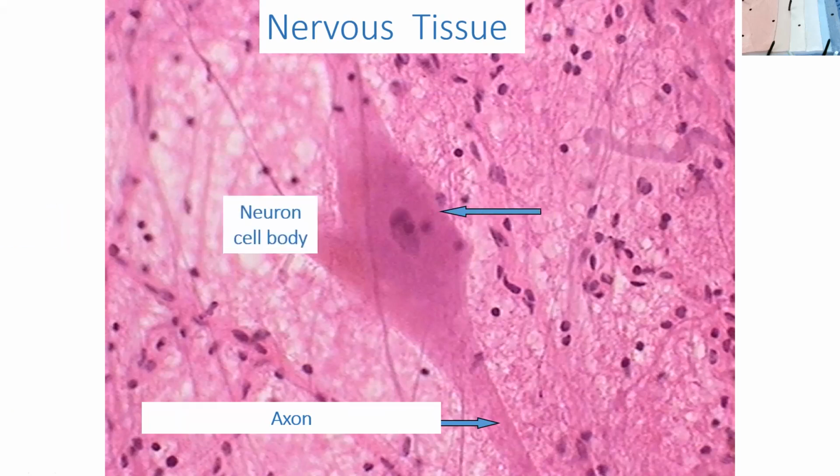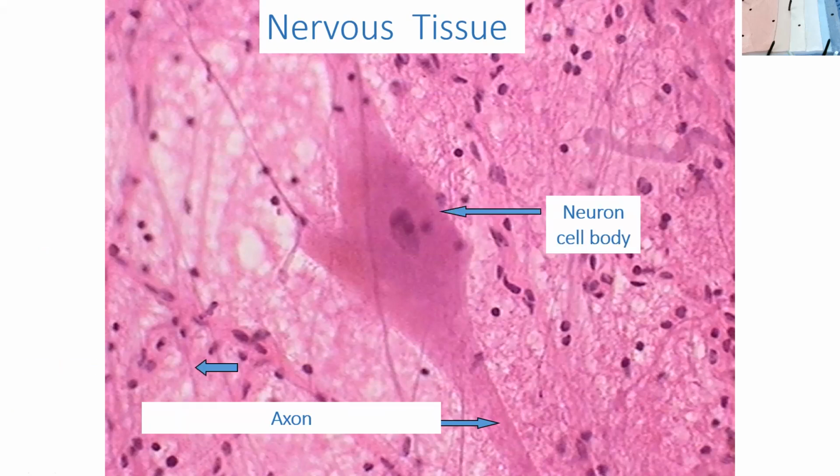We also see, that's the neuron there, those little dark purple things are called glial cells or neuroglial cells. There's 6 different categories of glial cells, and they are the helper cells. There's a whole lot more glial cells than there are neurons. But the glial cells, as you'll learn in lecture, help to defend the neuron, help to feed the neuron, help to protect, defend, and destroy the neuron when it becomes damaged. The glial cells do all this for us.